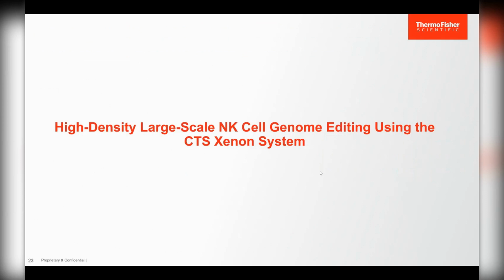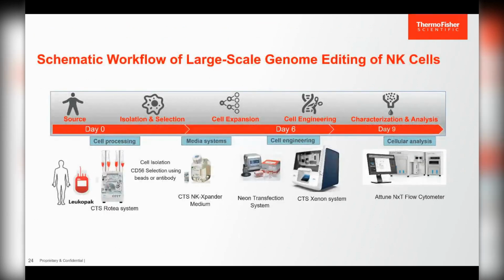To this end, how is the CTS electroporation system going to help edit different cell types on a larger scale? In the coming slides, I'm going to show the data on how efficient the CTS electroporation system is for large-scale NK cell genome editing. This is the schematic of the workflow for large-scale genome editing of NK cells.